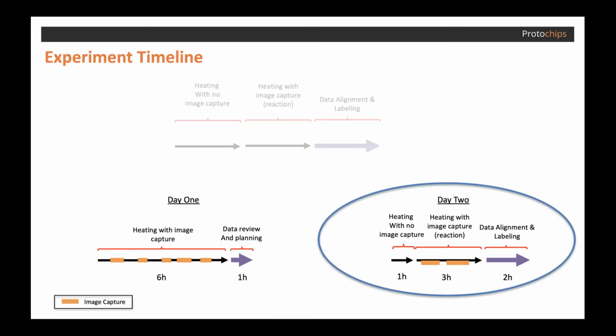Now, marrying the information on temperature or any other experiment parameters with the captured images will be a real tedious exercise with limited results, but it needs to be done. It needs to be done before we can draw any conclusions that are presentable. And those of you in the audience today who have had to perform this data alignment know that this one step alone can sometimes take as long or longer than the experiment itself.